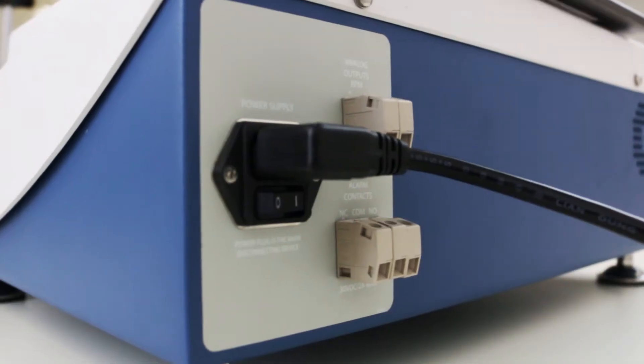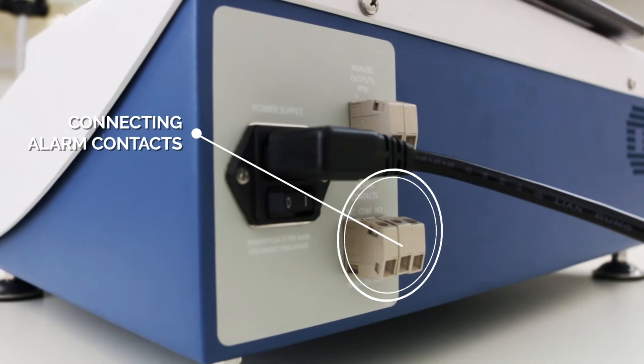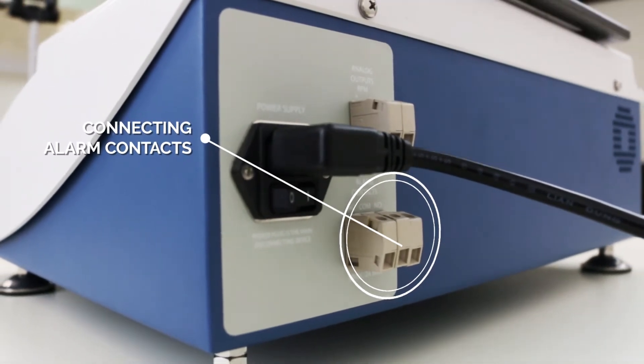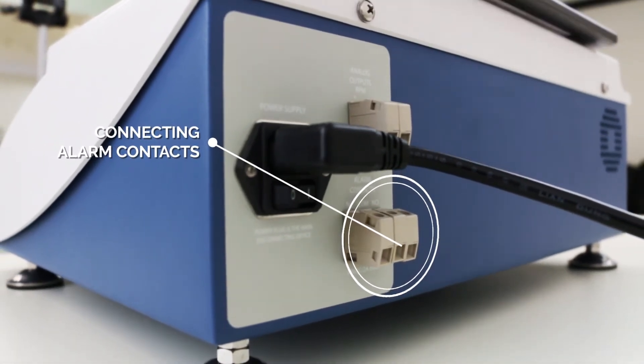The Ambient Shaker is provided with connecting alarm contacts that monitor speed, shaker imbalance, and power recovery alarms.